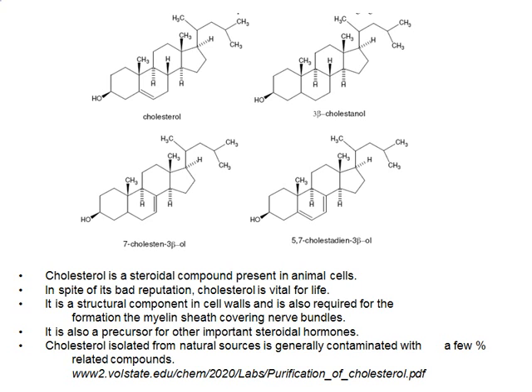It turns out that cholesterol is typically isolated along with these three very structurally related compounds that are present at trace levels, a few percent. And so the basic idea here is to see how we can isolate cholesterol from these very structurally similar compounds, which have similar properties to cholesterol to begin with.